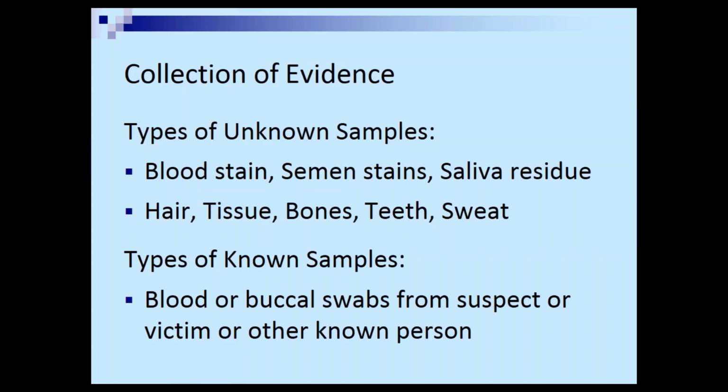So what we want to go over today is just a little bit about the process in the laboratory, but we're not going to go into a lot of detail. In the class JS 352, one of the forensic lab classes, that's where we go into a lot more detail about the DNA analysis and blood and body fluid testing as well. But for here, we're just going to give you a general idea. So hopefully you can understand, again, it's all about understanding where those 13 pairs of numbers are coming from, and also why we can say they're specific to an individual, even though they might not be identical twins.